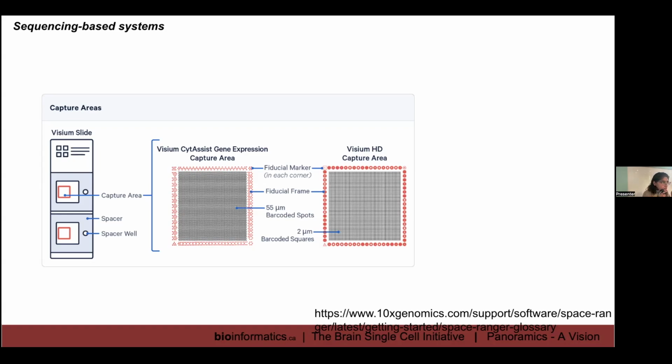So that is the closest that two cells, for instance, can be together for us to resolve them. Again, the principle is very much borrowed from image-based systems, because that is how we actually determine the resolution. And I think these are things that you have to understand before you talk about how much you want to deconvolute, whether you need to deconvolute.